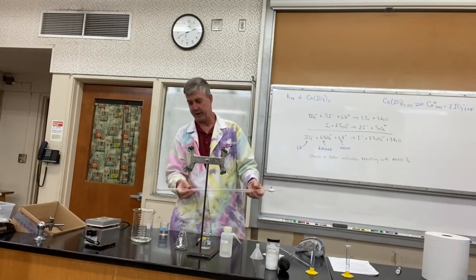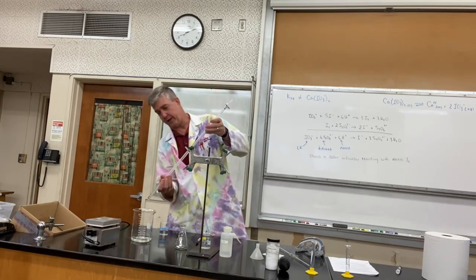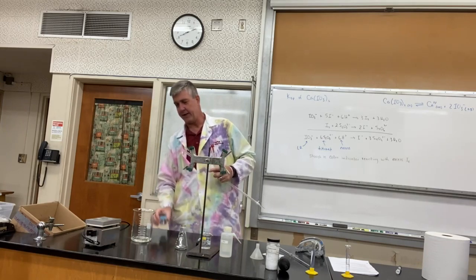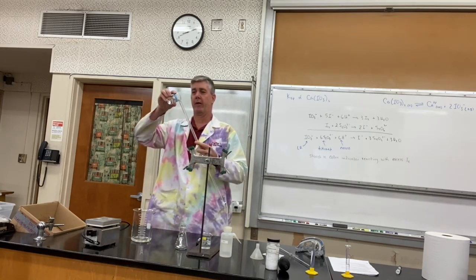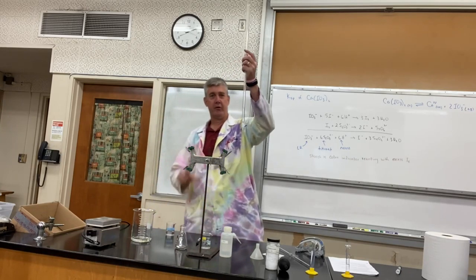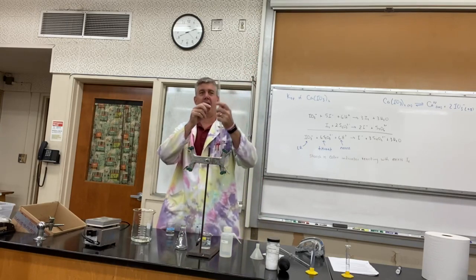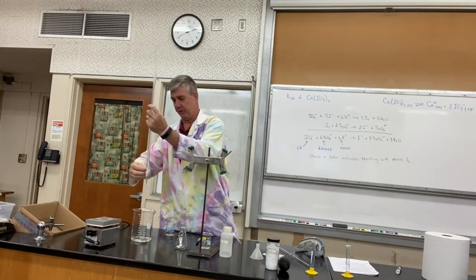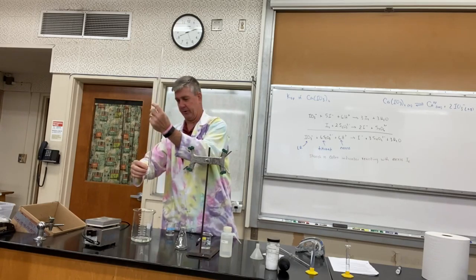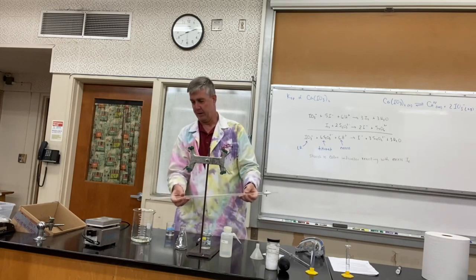We're going to put in just four or five mils of our thiosulfate or the titrant that we're going to be using, and we're just going to rotate and coat the inside of our burette with our titrant. So we're getting rid of the water this way, and as we do this we also want to make sure that we condition the pipette tip as well. We're going to let some of that flow through the burette tip.